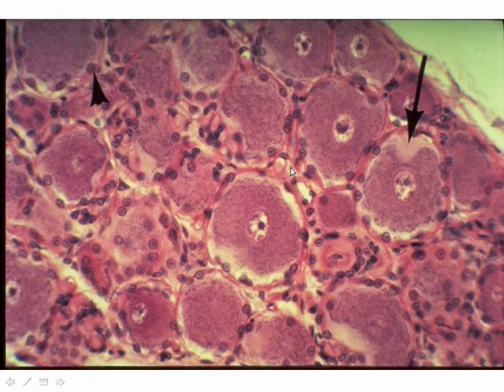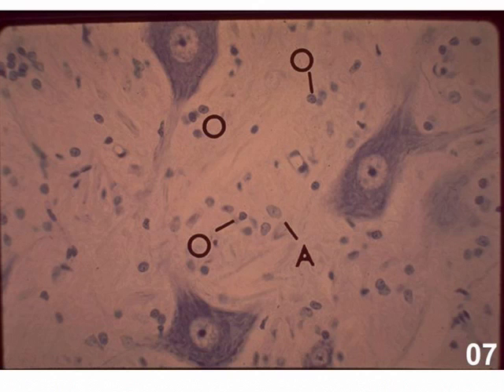So by comparison, this is the micrograph at high magnification of the peripheral nervous system. So let's step back just for a moment to the central nervous system. One of the things that is true of the central nervous system is that it has very little to no connective tissue in it. We haven't learned about connective tissue yet, and we will be discussing that in the next lab.